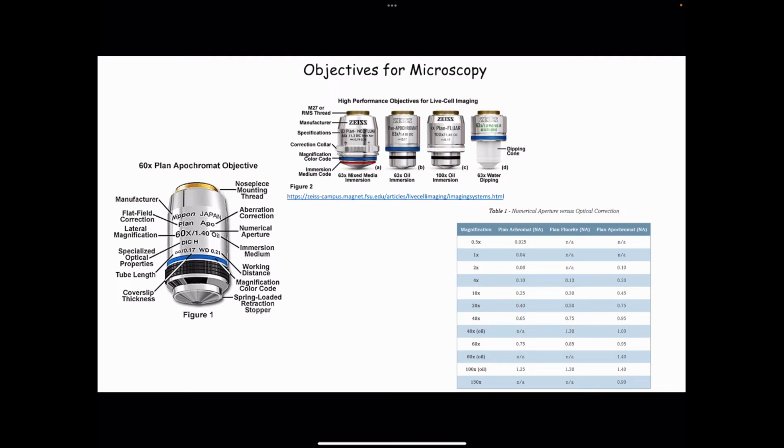Because this is a system that has been created throughout the period since microscopy started to develop and manufacturers started to develop this microscope. So we should make complete use of this and remember not to use any type of immersion media with any other type of objective, because they are not always compatible with each other, as a result of which it can cause huge damage to your objective, and it can cost you a lot of money.